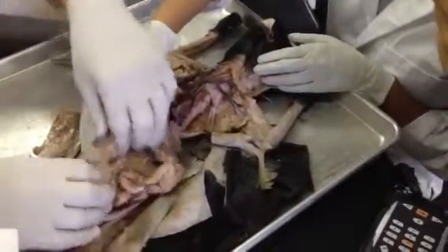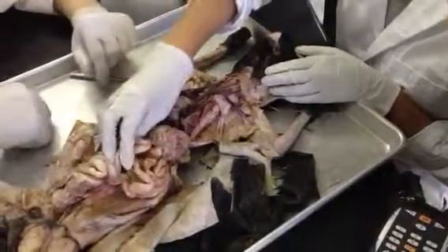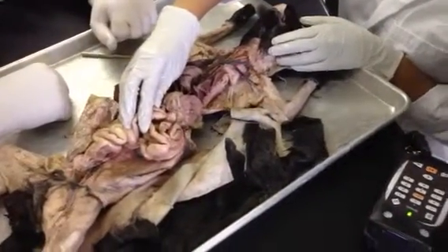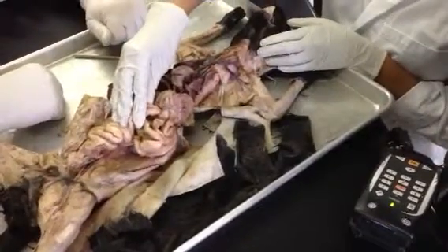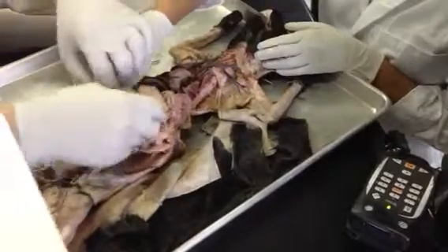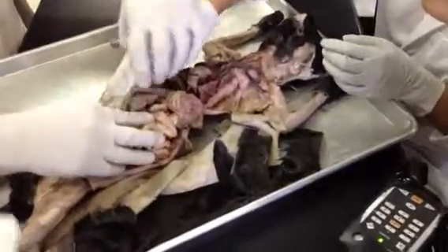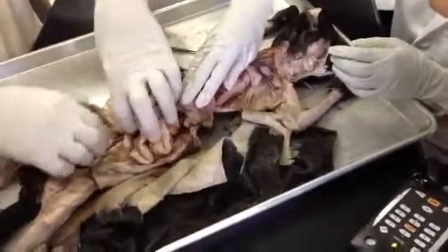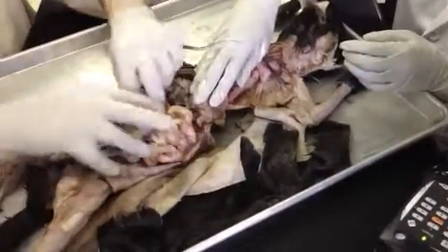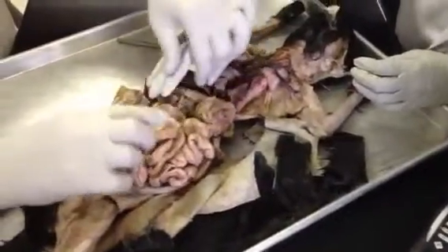For the jejunum, I'll place your hands right out here. That's the intestine out there. And I'll tell you that it doesn't connect to the stomach, and it doesn't connect to the large intestine either. That means you must put on your answer sheet, jejunum. Then the third part of the small intestine is the part that does connect with the large intestine. That's the ileum. I'm going to move your hands away for a second and straighten everything out here so that I can see what's going on. I'm going to rearrange this stuff a little bit. And right here, give me your index finger.